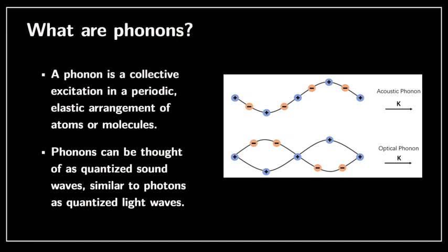the acoustic phonons are. You also have optical phonons, which are those that are not acoustic phonons. Basically, for the optical phonons, there is an example shown on the right. And I'd like to take a second here: why do we call them optical phonons? It turns out that if you look on the right-hand side, you see that the vibration, the bottom plot, shows that there is actually a creation of a dipole moment there, a change in dipole moment as you have a vibration.